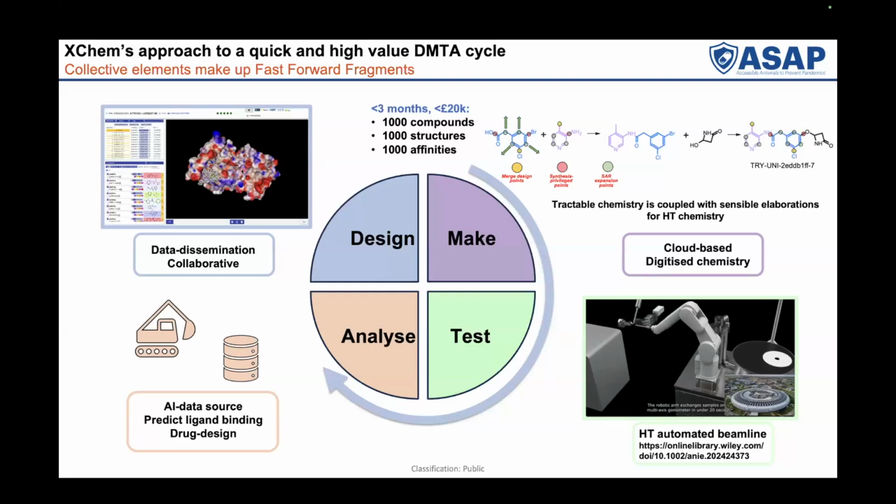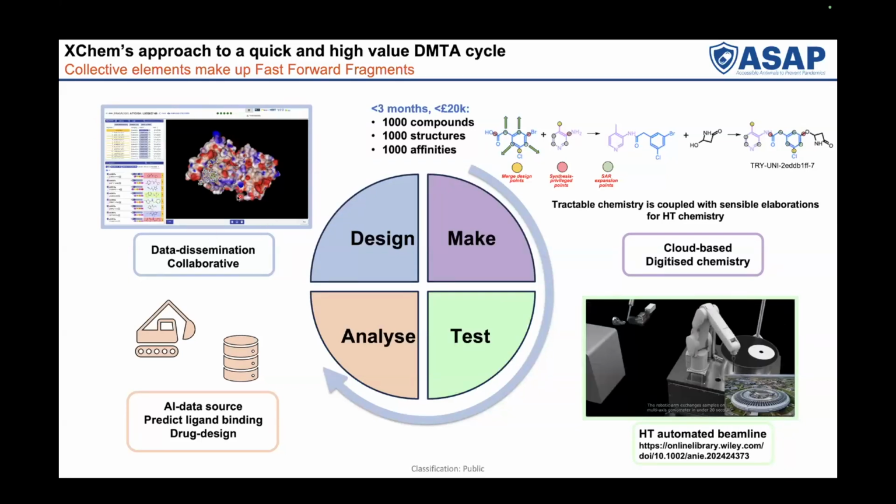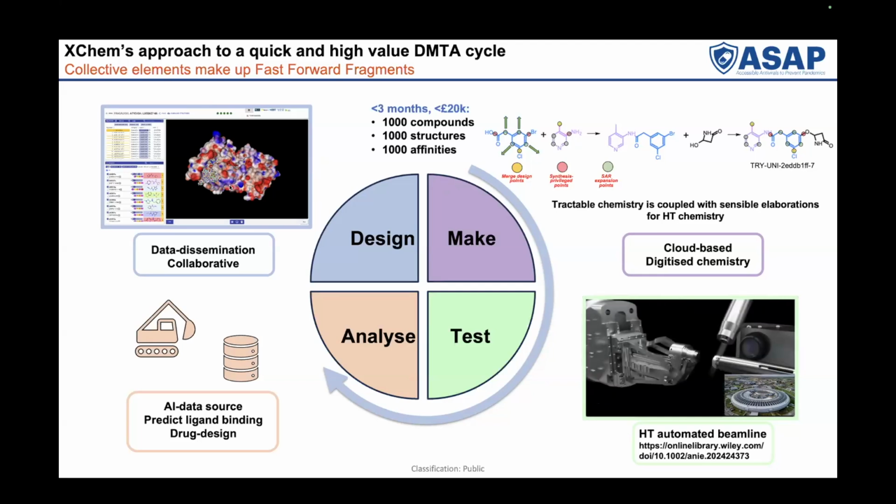We've developed Fragalysis, which is a web application for uploading structural data from XChem. It also allows the upload of in silico molecules and comparison of the in silico molecules to the experimental structures. It's an ongoing effort, but the idea here is, can we allow the structural biologists and medicinal chemists to communicate with one another through data sets that are well curated and annotated.